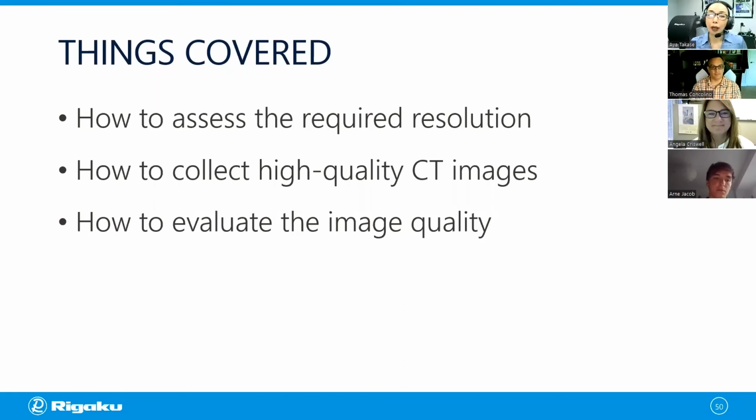Now you know how to assess the required resolution and how to collect high quality CT images. And in a nutshell, you want a relatively small sample and to spend a long time. And you now also know how to evaluate the image quality before you start the analysis.